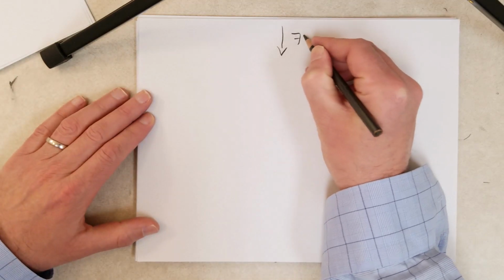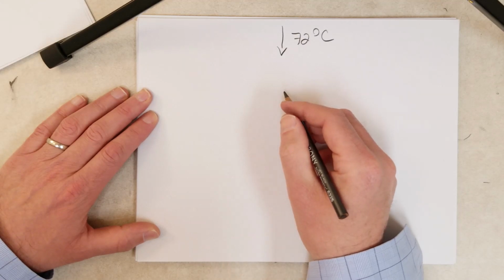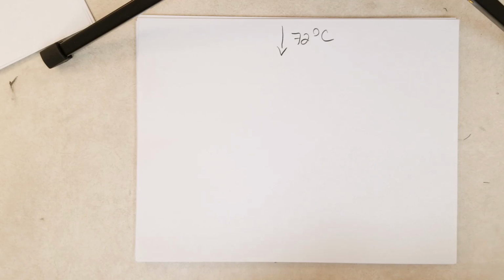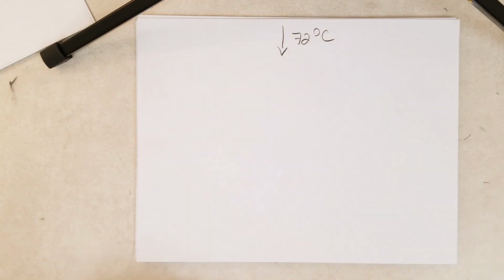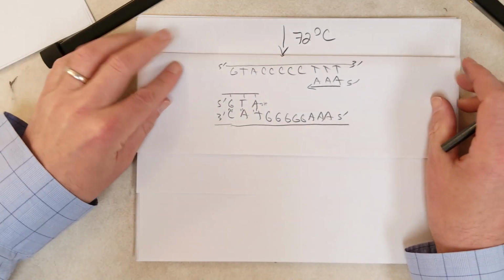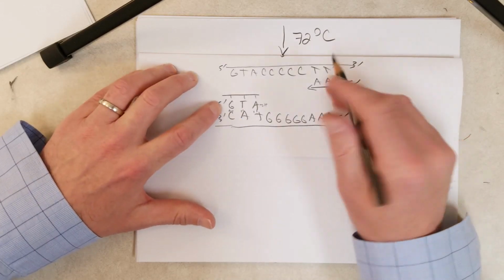So we raise the temperature of the reaction to 72 degrees Celsius. And you know what likes that temperature? The polymerase likes that temperature. So instead of me diagramming this whole thing again on a new page, what I'll do is I'll fold this guy like this. Okay, so we raised the temperature to 72 degrees.